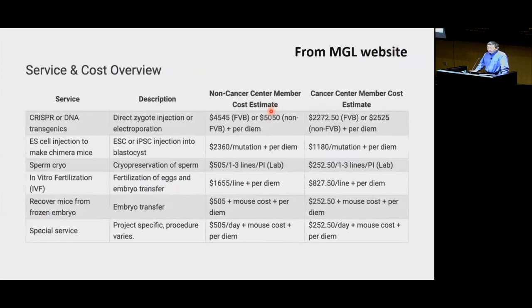When you go up, because of your specific situation, you have to flox, let's say, 3 kb. Then I will say we can still try the CRISPR approach, but you have to understand it may not work, and we can try again.